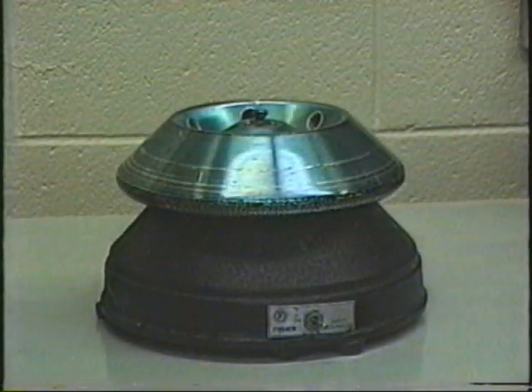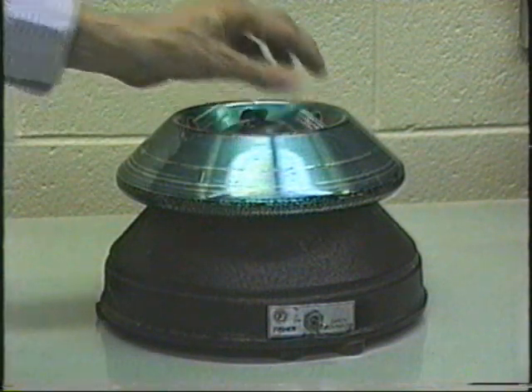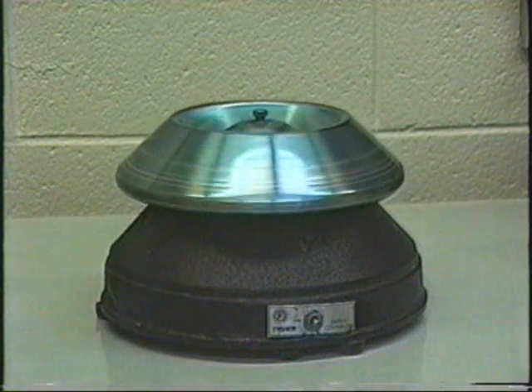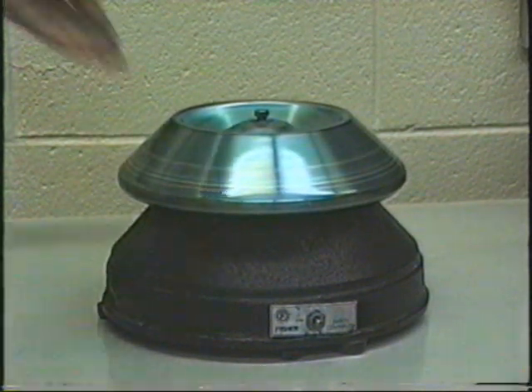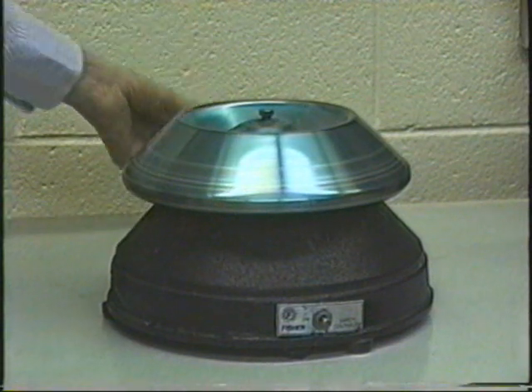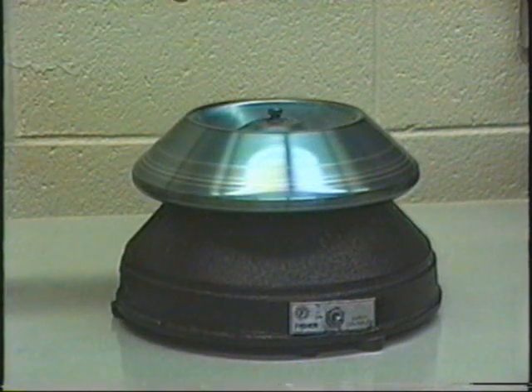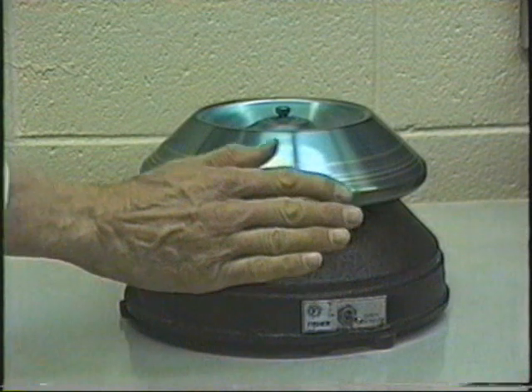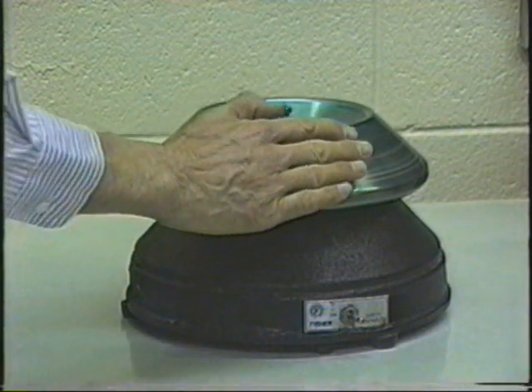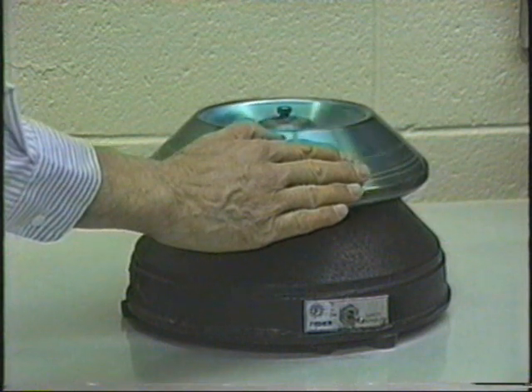All right, let's go over that one more time then. Make sure that when you put something in to centrifuge, you put a counterbalancing tube in. Then when you turn it on, make sure you keep watching it so that the centrifuge, as intended, doesn't walk. Make sure it doesn't touch anything such as the cord. Keep your hands away from the centrifuge while spinning, particularly on the top here. And then when you turn it off and you want to slow down, make sure your fingers are in the direction of the spin, and then just lightly, gently slow it down.